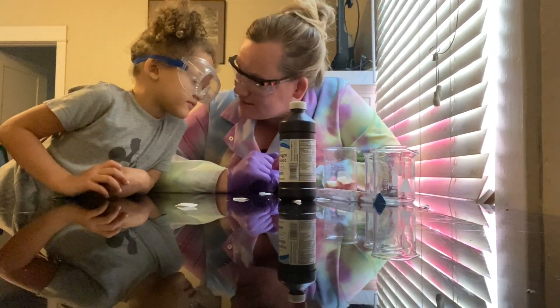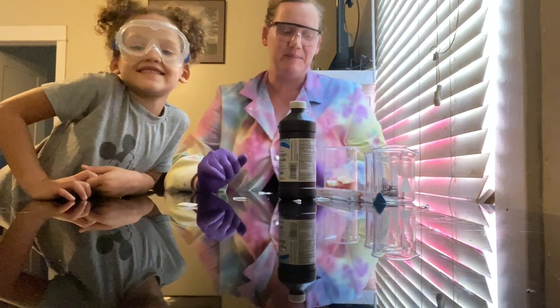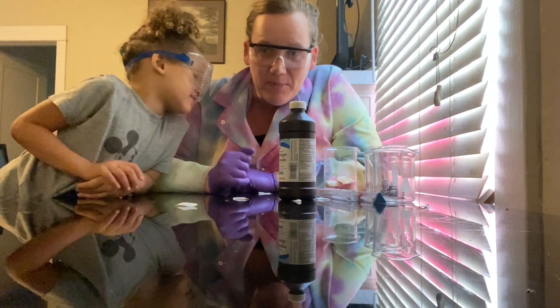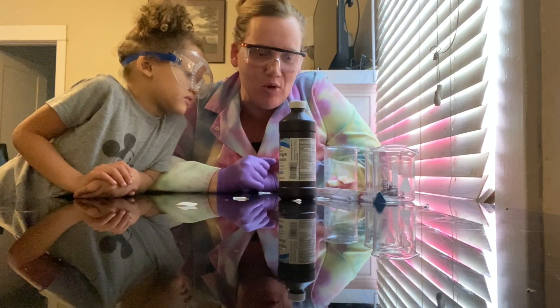Today we are looking at enzymes. Enzymes are a really important type of biomolecule in your body that help to speed up chemical reactions.